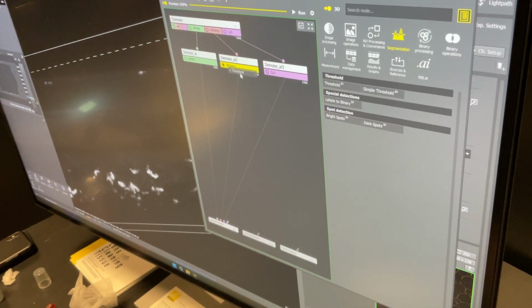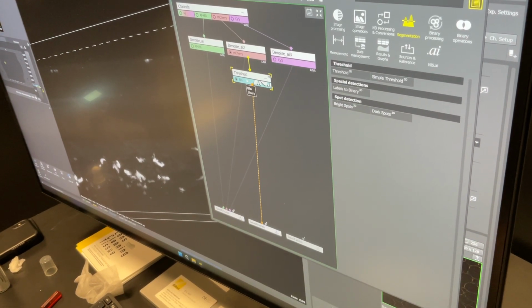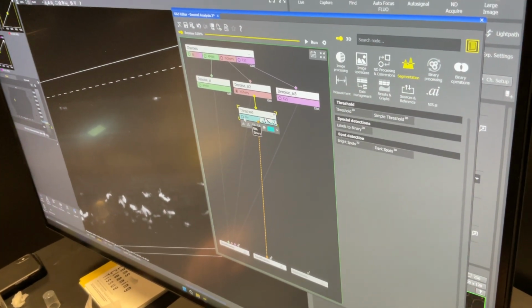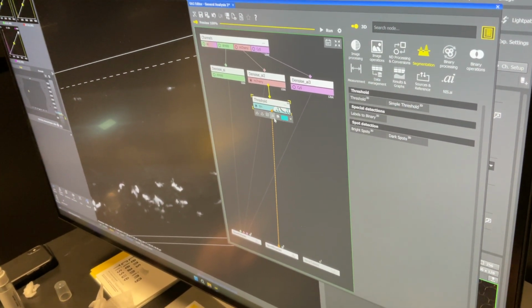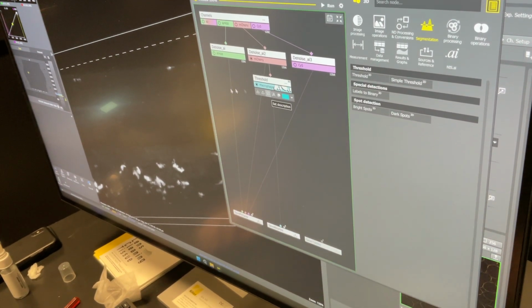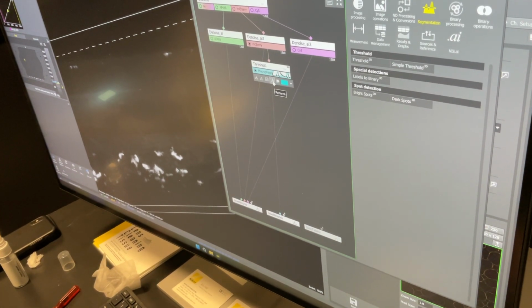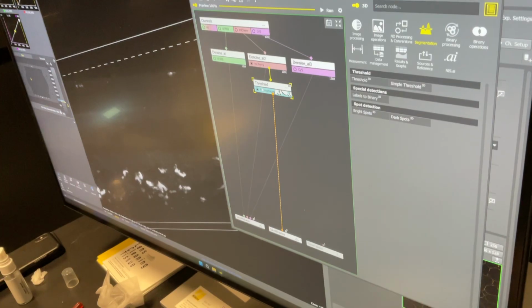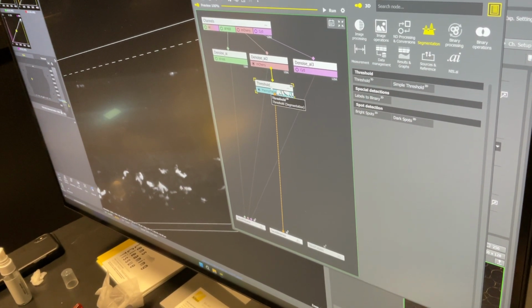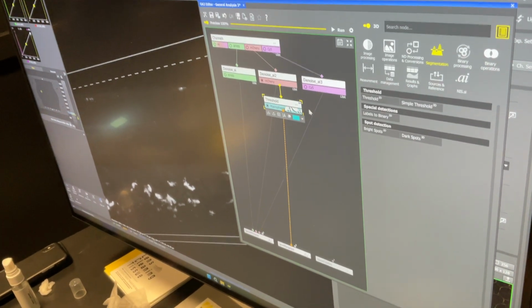3D segmentation. I'm going to drop that on my Cherry channel here. But the other cool thing here is what we can do. What would we call these cells? I call them macrophages. Alright, so we're going to rename this channel so that we know what's happening as we work down here. So I right clicked, it chose rename. The white top is the function, the bottom colored bit is the output. And if you right click on them, they do have different tooltips. So just bear in mind.